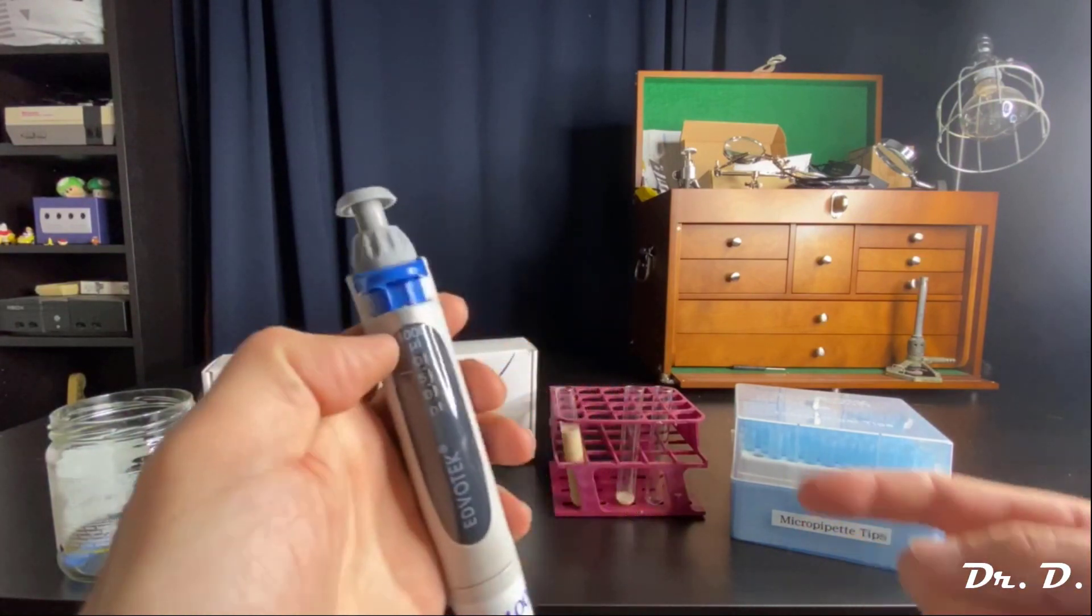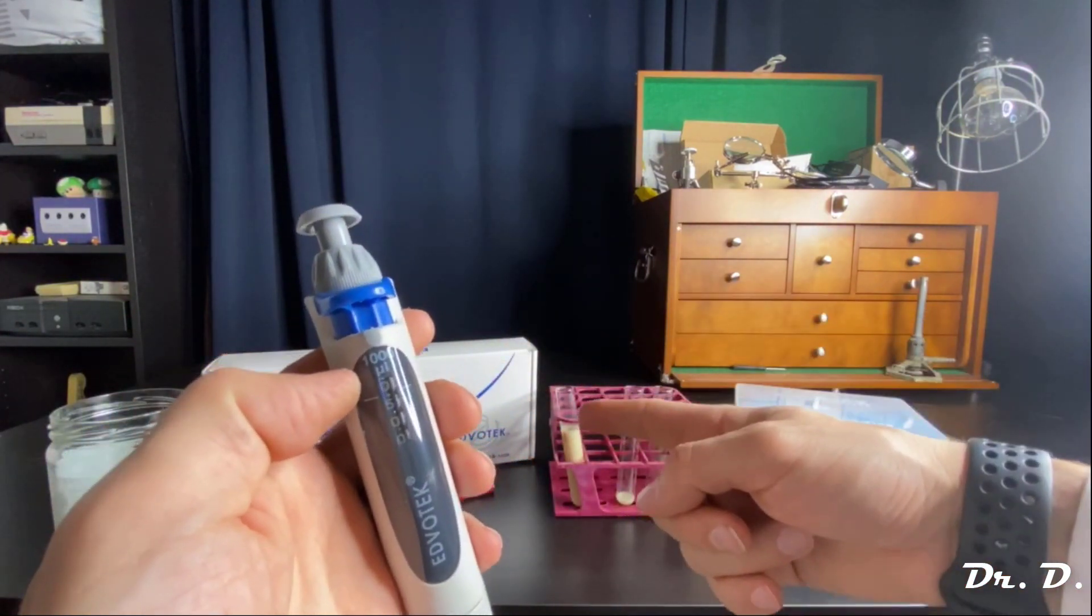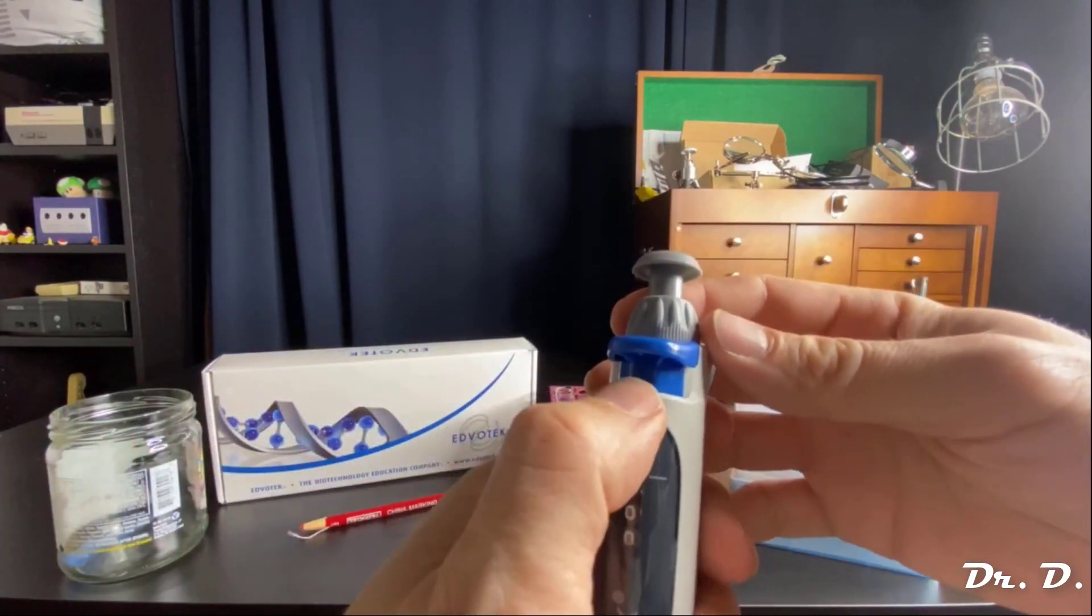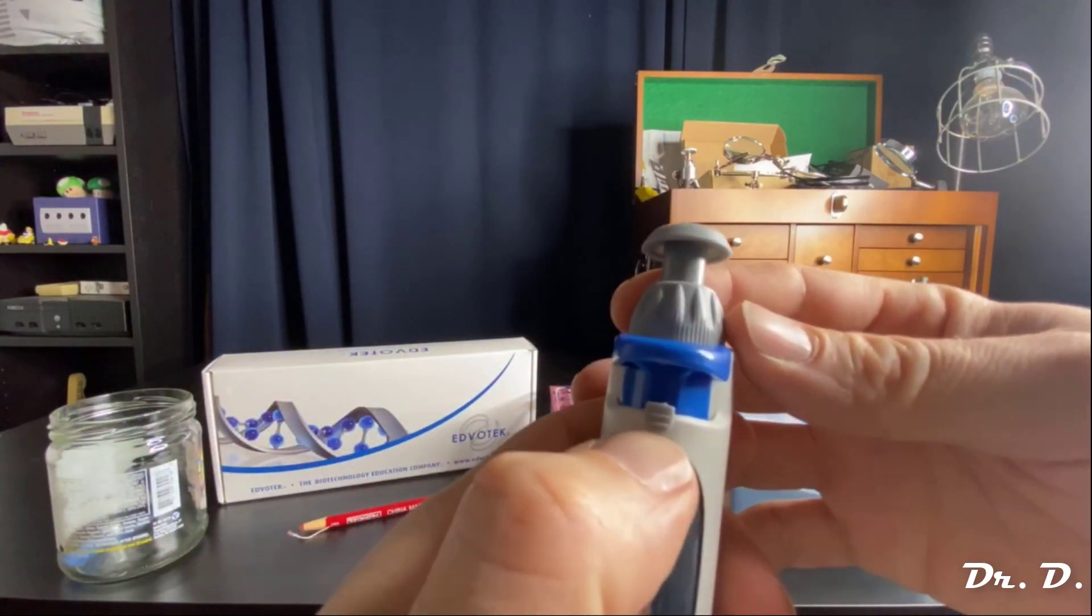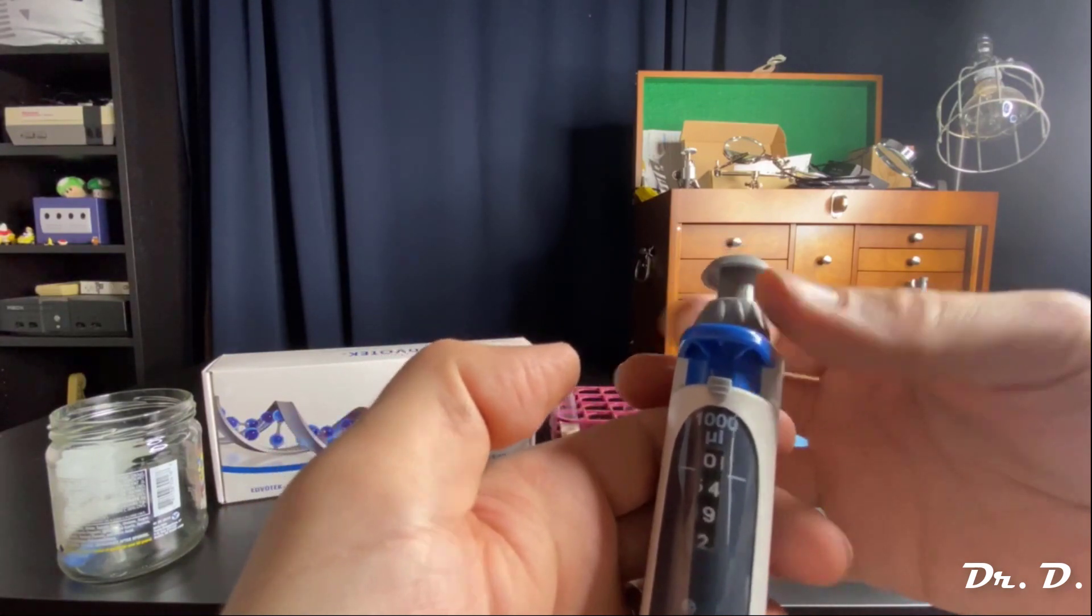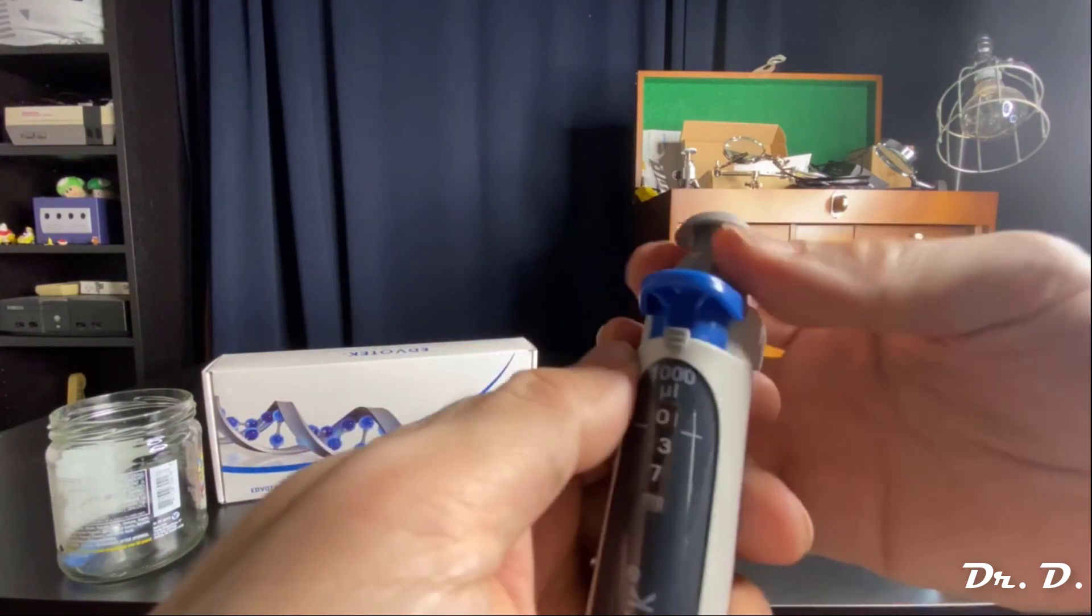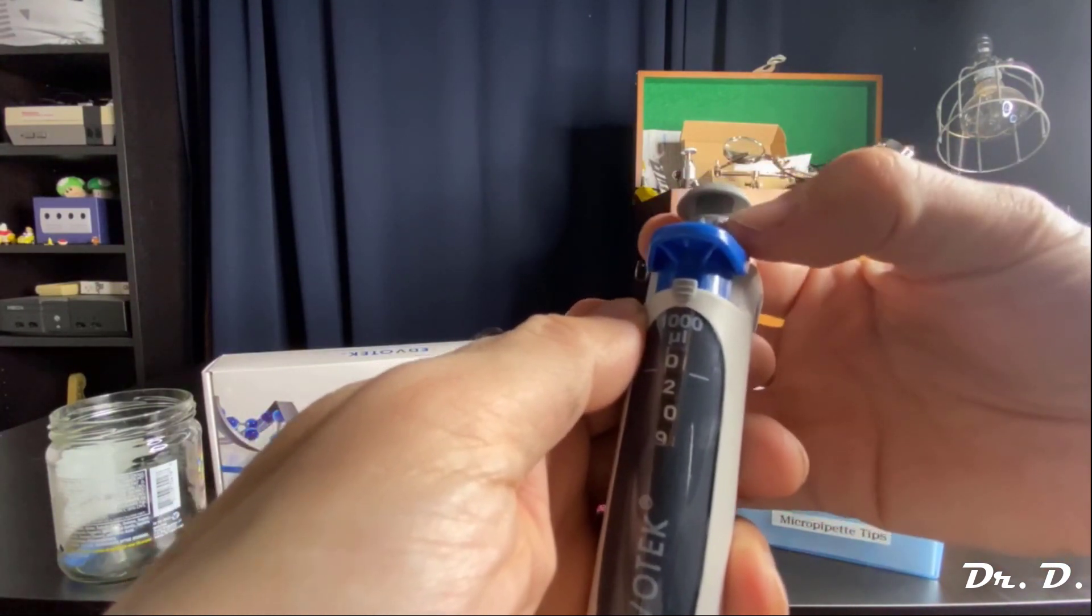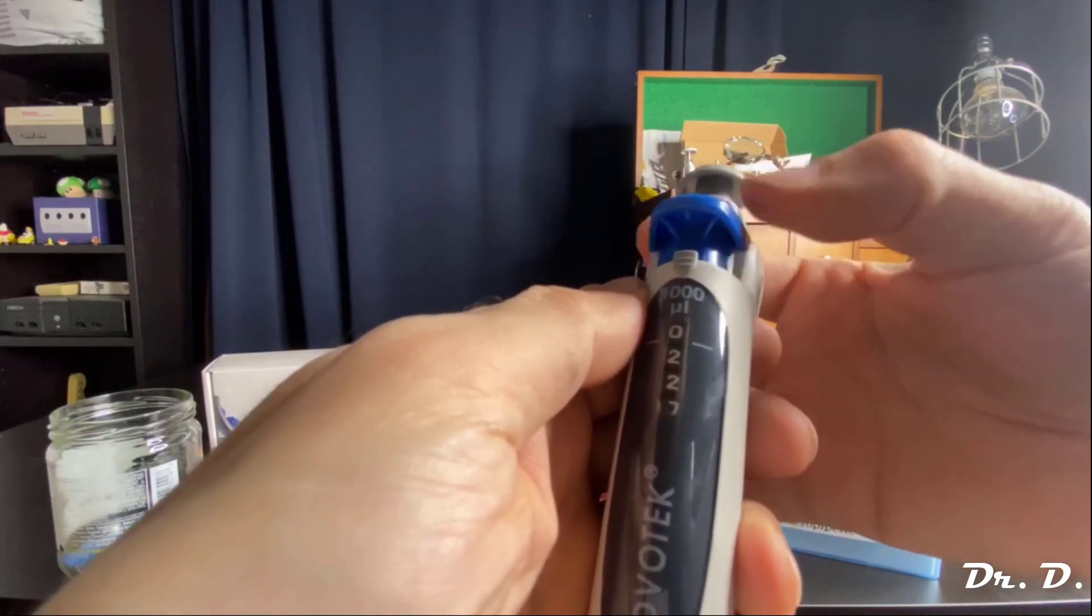Again, let's say I want to add 250 of this solution to tube three. Again, I'm going to unlock this lock button, turn it downwards, because I'm at 500, I want to turn it downwards to 250. And remember, the lowest I can go is 100 microliters. So zero, one, zero, zero. So I went too far. So I want to get to 250.